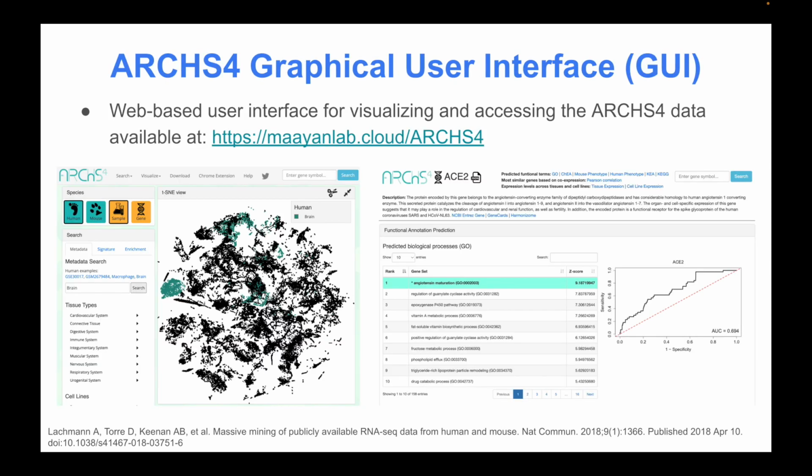All of the data is served on a web-based interface, which provides interactive visualizations of the integrated gene expression data, metadata querying of individual samples, and gene pages with predicted functional annotations. The processed data can also be filtered and directly downloaded from the portal or programmatically for users to run additional analyses.